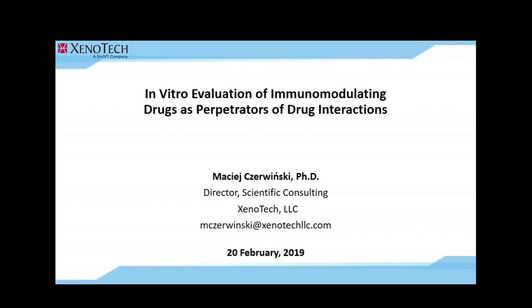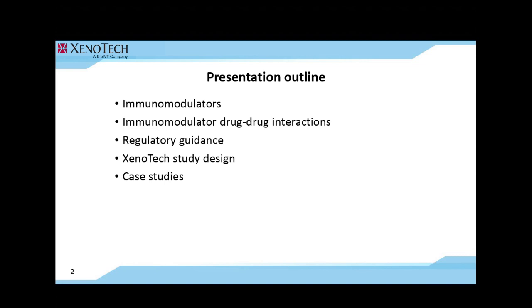Today, I'll describe XenoTech's approach to evaluate in vitro drug interactions of immunomodulators. The aim of our presentation is to inform you about our approach to evaluate potential drug candidates to modulate expression of drug metabolizing enzymes, with emphasis on immunomodulators, which exert their effects indirectly through action of cytokines.